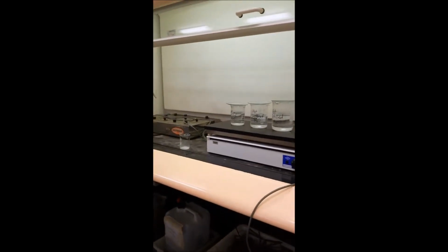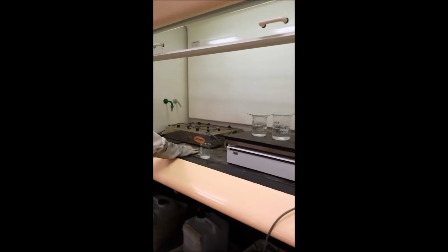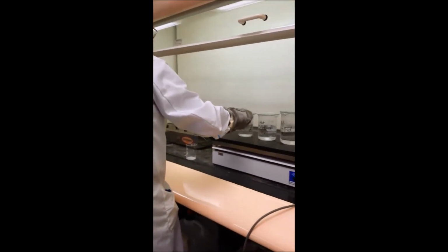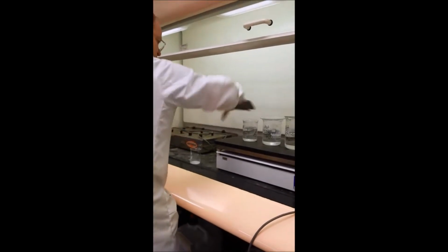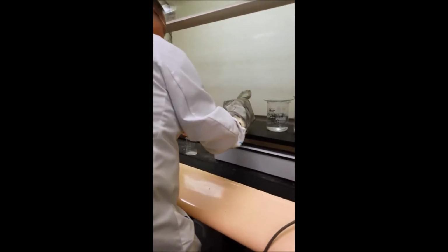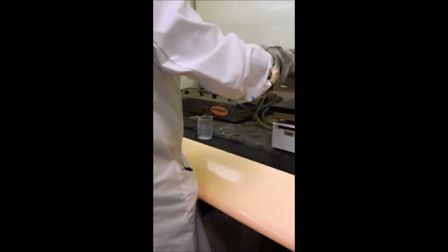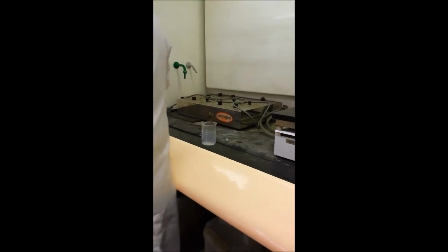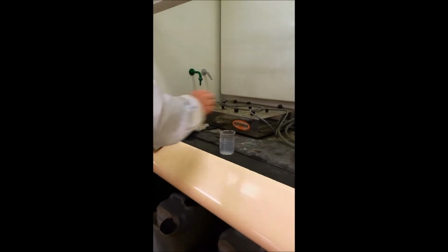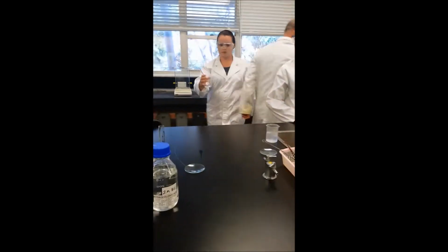Don't empty these out and put them back on the hot plate. You empty it, put the empty one down there, and I'll refill it and reheat it. Okay, take that off. Now we're going to go up to 100 mils. There we go. Okay, there's our starch. Alright, let's go back round. We need 3 of those containers.